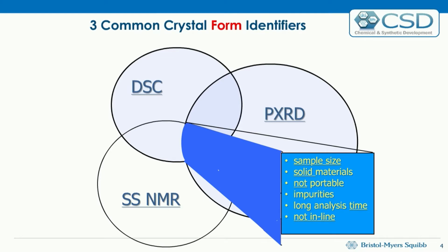And these are the primary methods. They're the backbone. The only catch to it is if it's not a release method and instead it's a production environment that you're concerned with, these methods take a long time and don't have an advantage of being able to work in a fast-moving production environment.